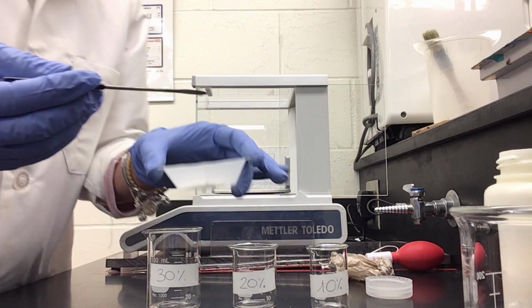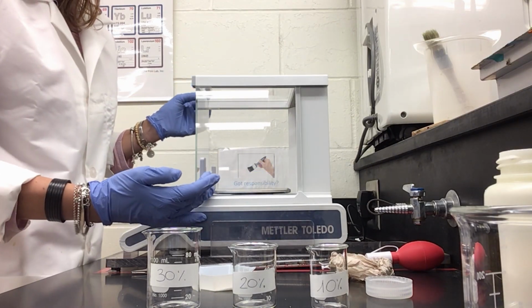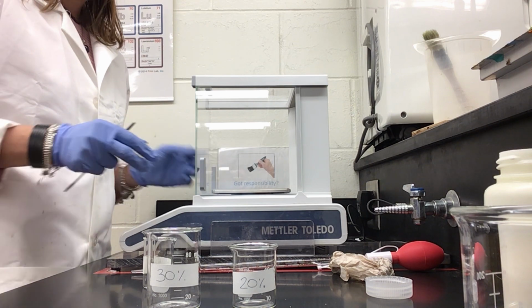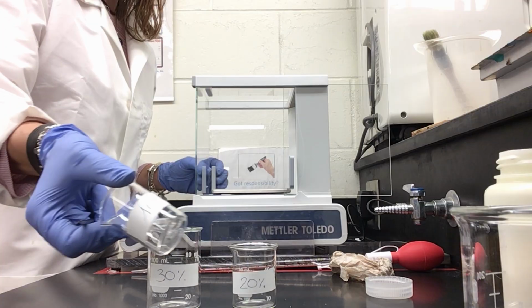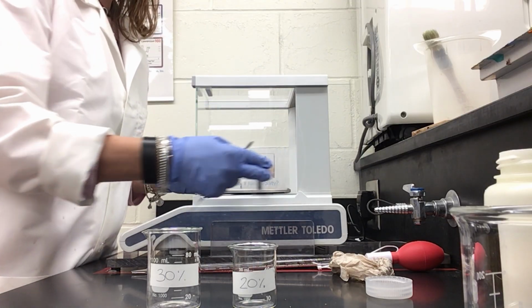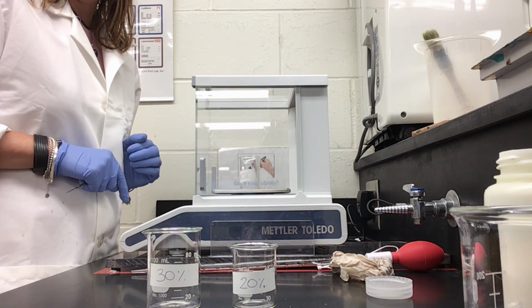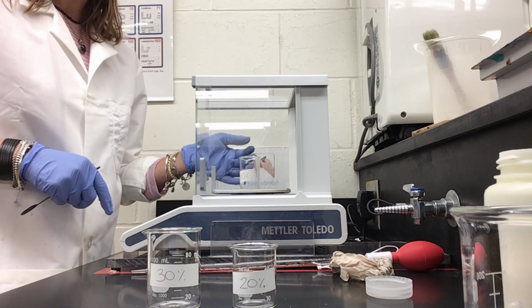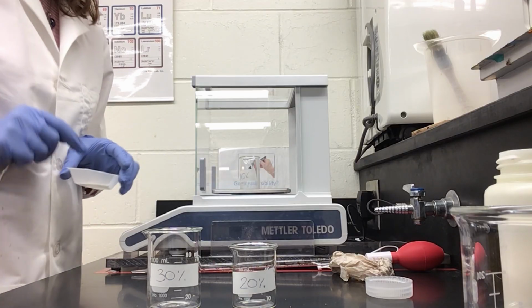Okay? So now I will close the door of the scale. You press the 0 to zero the balance, and then you open the door, you put your beaker labeled with 10% inside, you close the door, and then you press 0 again, because you don't want to measure the weight of your beaker. You want to measure the weight of the sugar that you're gonna put inside.